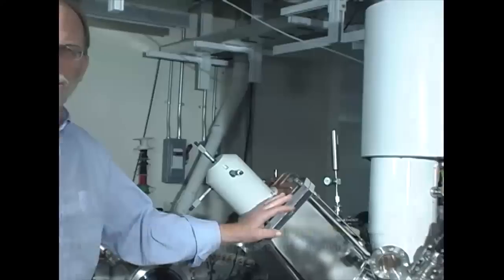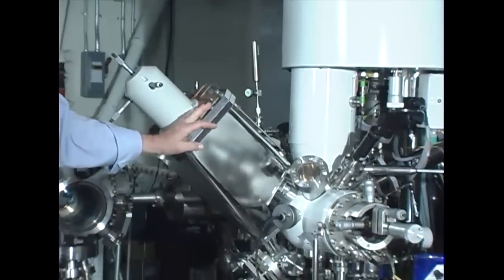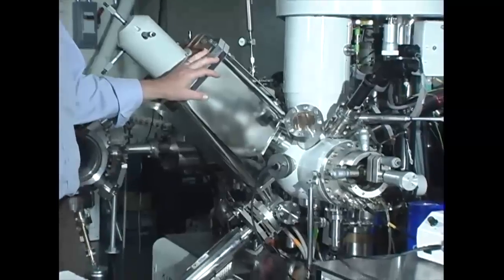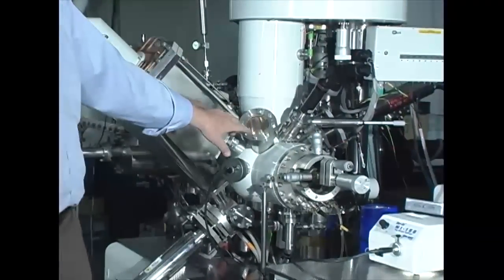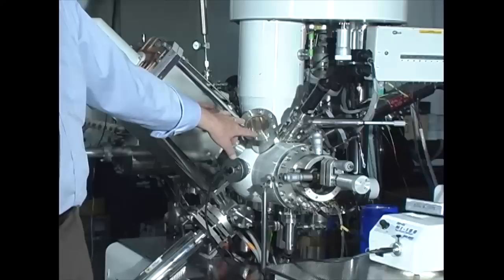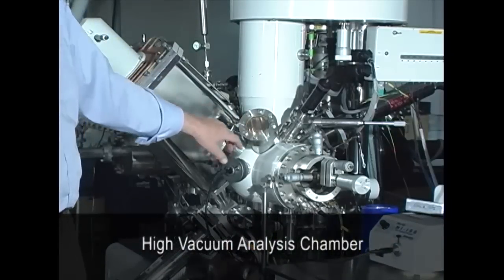So this is one of our primary tools for surface and interface characterization of molecular electronic materials. This is known as a photoelectron spectrometer. We have two primary techniques that we use this for: X-ray photoelectron spectroscopy and UV photoelectron spectroscopy. The sample is positioned inside this high vacuum analysis chamber.